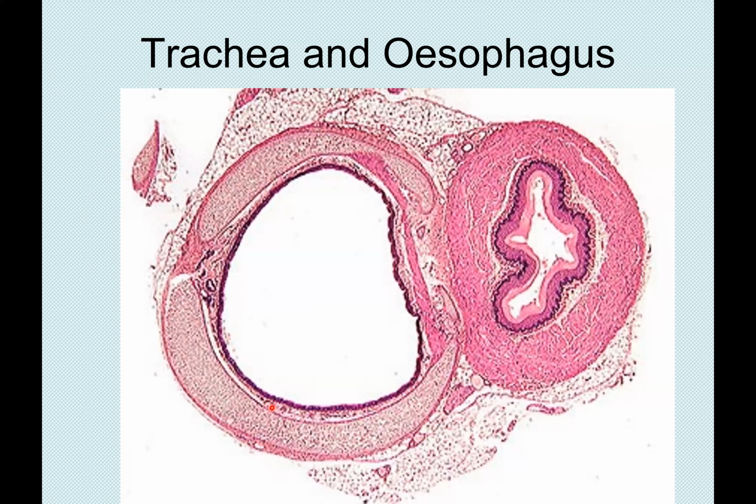Now, if you want to see the lamina propria, do you see the epithelium? Can you see a very small whiter part before the main whiter part over here? Oh, you can't see it. Okay. So after the epithelium, if you actually enlarge this, you see that there's a smaller whiter part. Then after that, there is a black thing before the main white one.